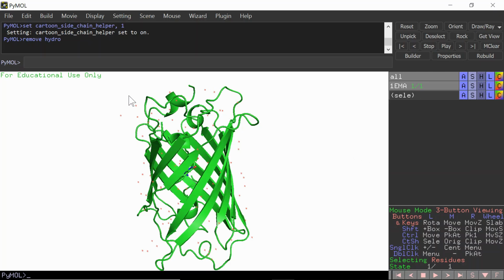You may notice red marks around the protein. These are part of the solvent that was left over from the capture of the crystal structure. If you click one of the marks, you will see it highlighted in pink.